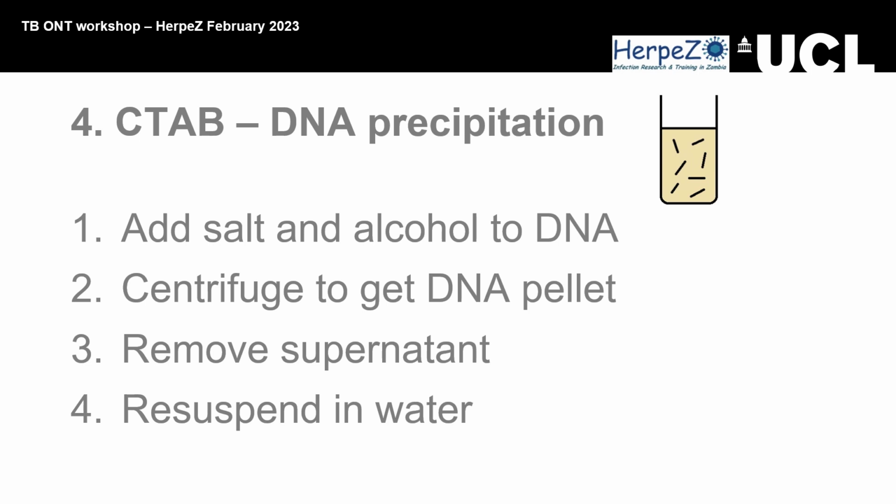So in a ratio, it depends on the amount of DNA that you started with. You have to know the amount of DNA that you start with in order to know the amount of isopropanol you're adding to the sample.